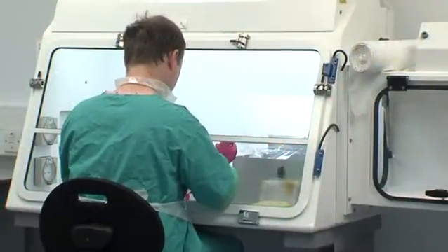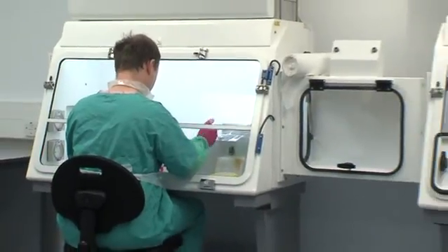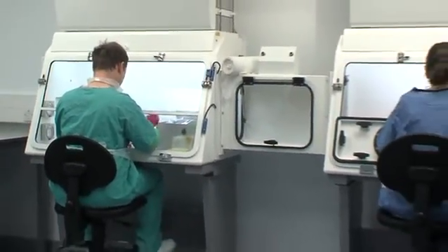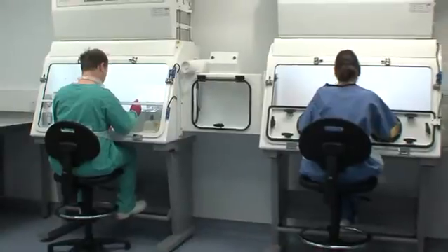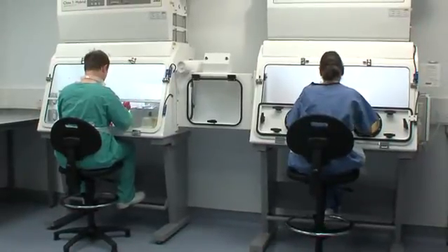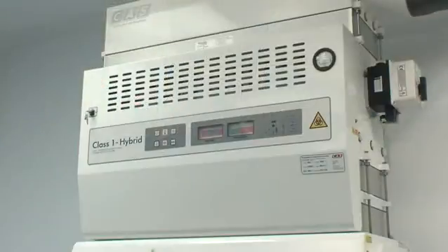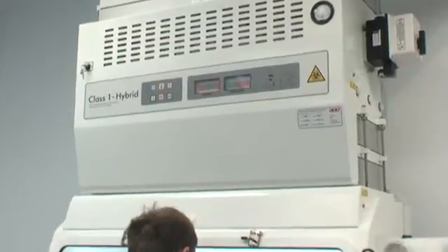Microbiological safety cabinets are designed to protect the operator, the lab environment and work materials from exposure to infectious aerosols and splashes that may be generated when working with materials that contain infectious agents.